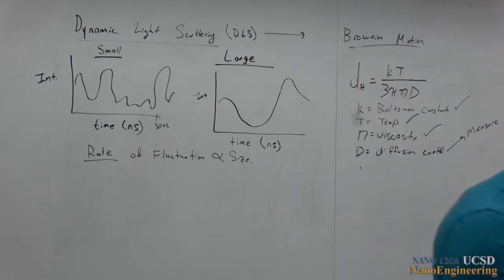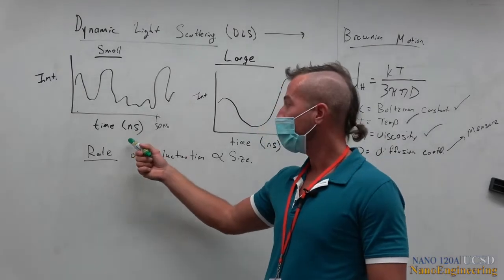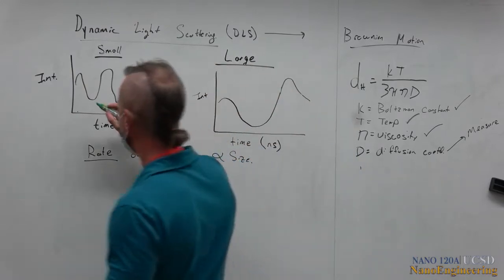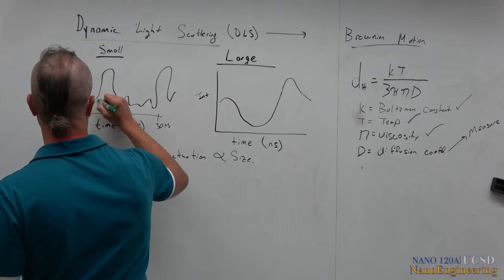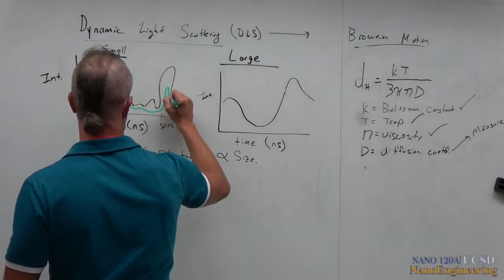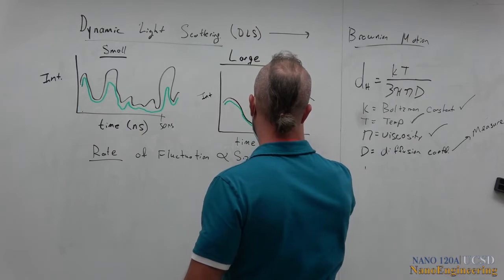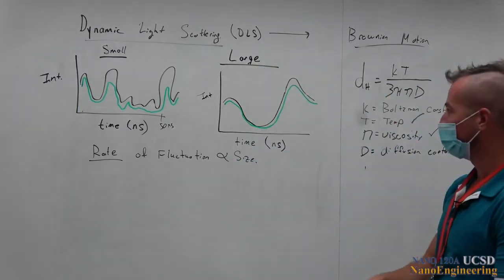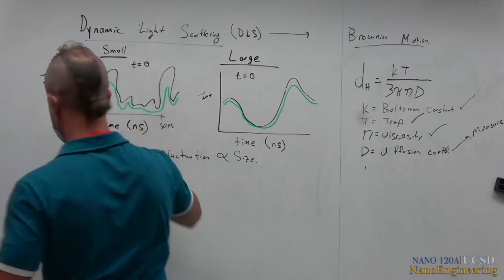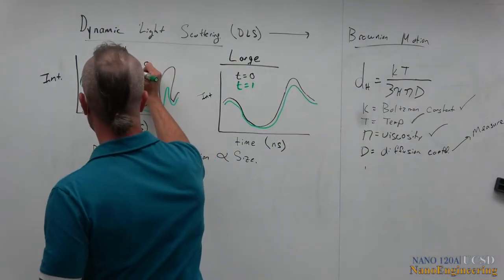Okay. So what I'm going to do next is repeat this again. I'm going to maybe wait a second, and then repeat this nanosecond measurement, and look at intensity versus time. Repeat the exact same thing. Okay.